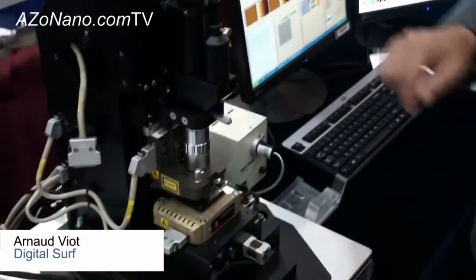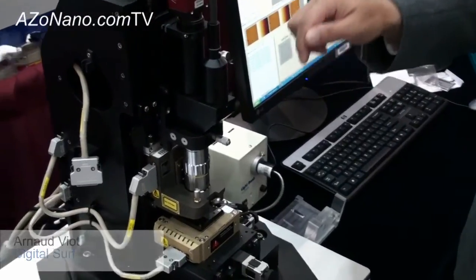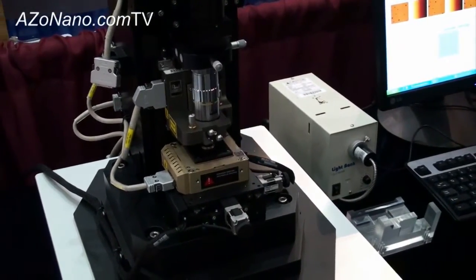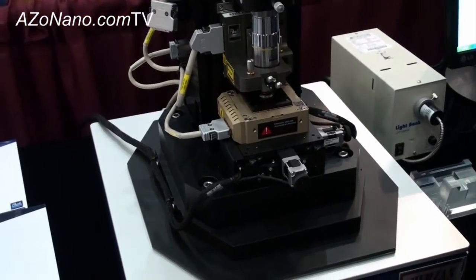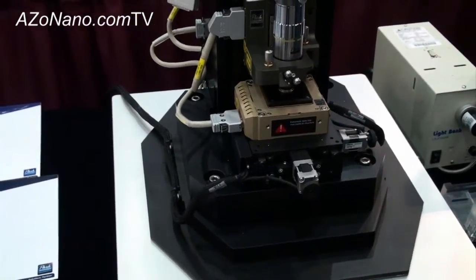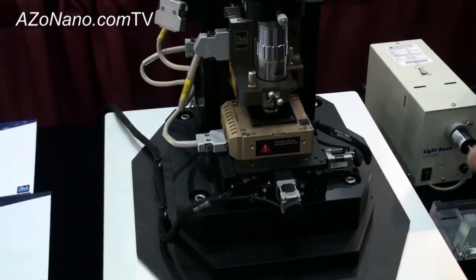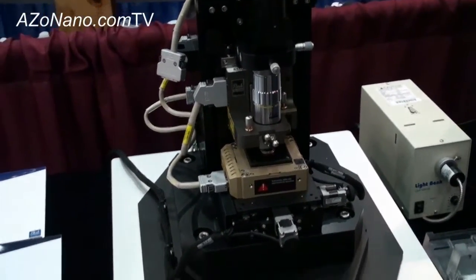The Z axis scanner has very high scan speed and very high servo bandwidth, so we can achieve true non-contact mode, which is far superior to conventional tapping mode. With this new non-contact mode, we don't get into the repulsive force region between the tip and the sample, so the tip does not actually disturb the sample. The tip does not wear, so we can preserve both the tip and the sample, achieving much higher resolution in AFM imaging.